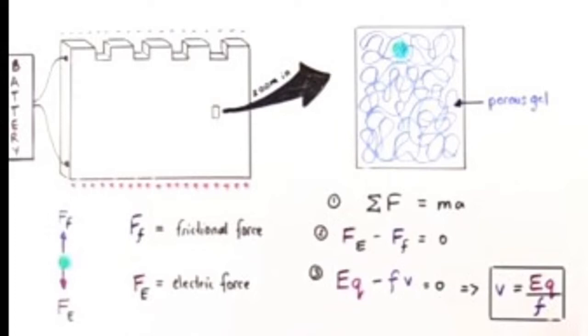So now again, we know the forces that are acting on this object. Since we know these forces, what are we going to do at the moment? We are going to get those forces and put where the summation of these forces is. So remember, we said that the frictional force is the opposing force. It opposes the movement of the protein. So since it's the opposing force, it will be negative. This is more like the supporting force, so this will be positive.